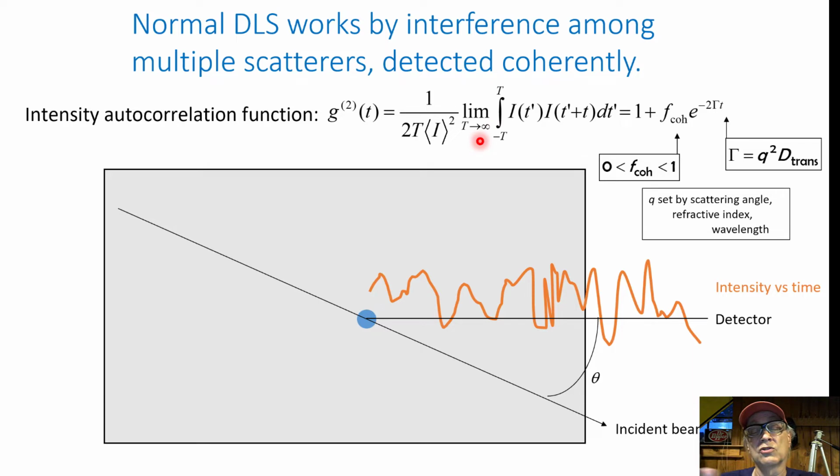We have got to let the system do many fluctuations in order to assess how long it stays in one state, more or less. So again, the idea of the correlation function is to look at a signal that's fluctuating, not randomly, because nothing is random, and see how long it stays correlated. Okay, if it's down, how long until it's up again? How long does it stay down? Okay, if it's up, how long does it stay up? So that's the idea of the correlation functions, and these signals have a characteristic time.